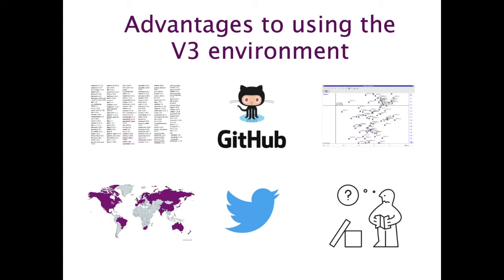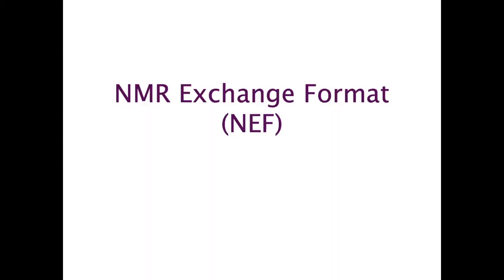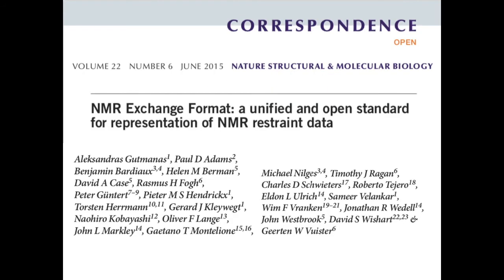What about all the software that's already out there? Well, that's where the NMR Exchange Format, or NEF for short, comes in. So this is a project that started quite a number of years ago. You can see this paper is from 2015, but it started well before that.